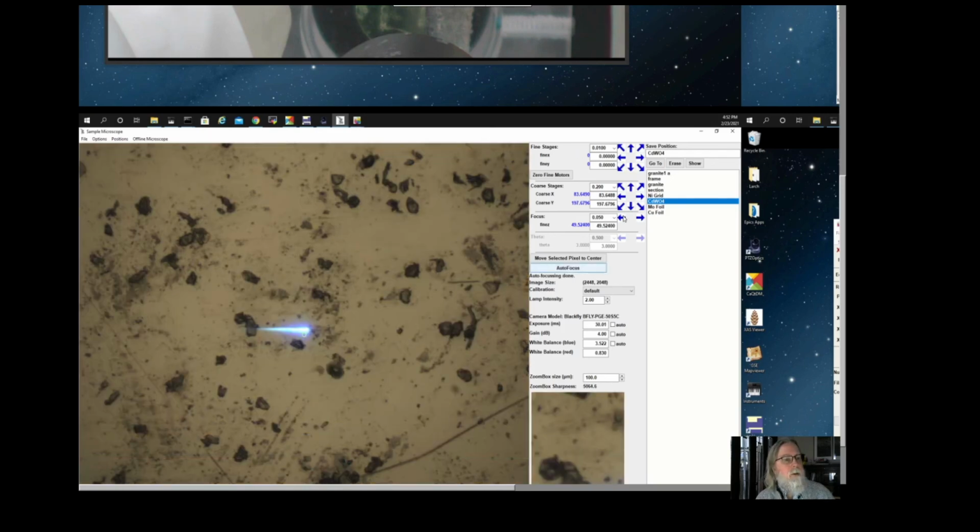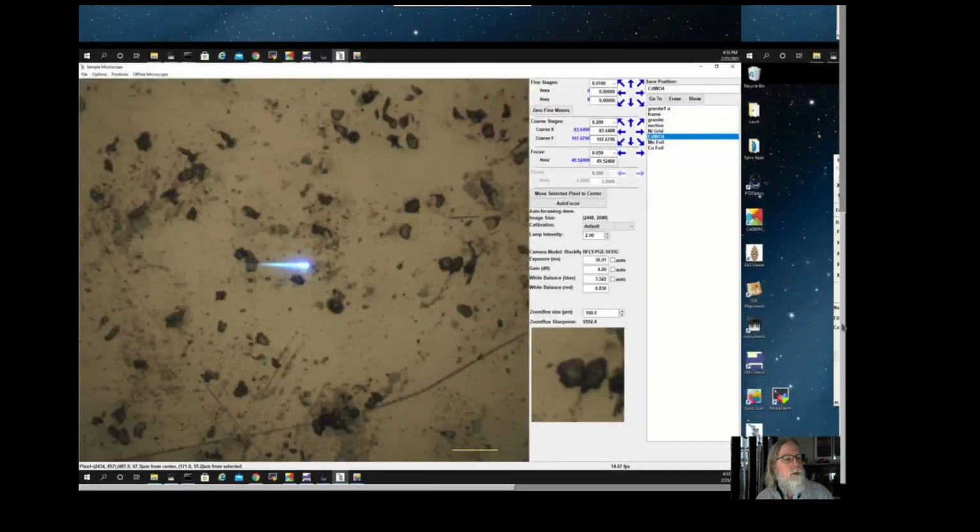And if I move the focus by 50 microns, the beam position on the sample will also move by 50 microns. It moves right and left, but not up and down. So as you're driving around, you can trust the height of the beam pretty well. But if you want to know exactly where you're analyzing, it's best to do an X-ray fluorescence map and trust what the X-rays tell you. Also, if you have done that, you want to not tweak and adjust the focal position, because that will move the X-ray beam right and left as well as in focus.